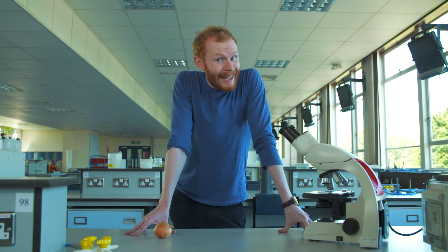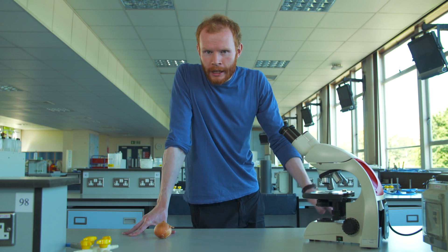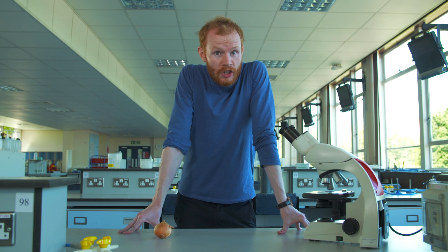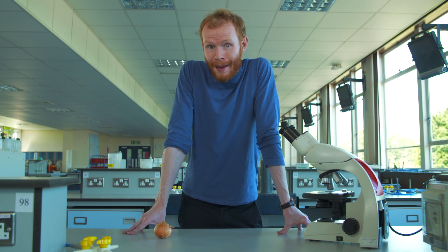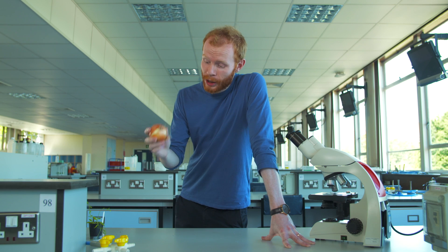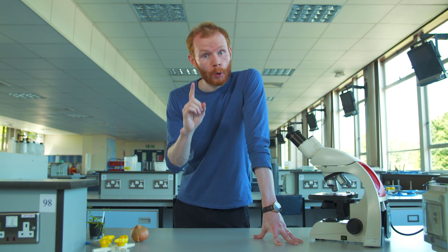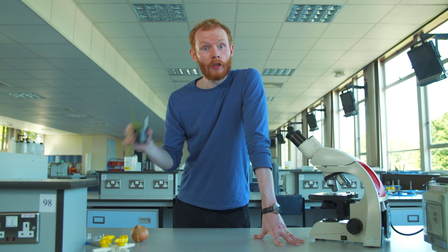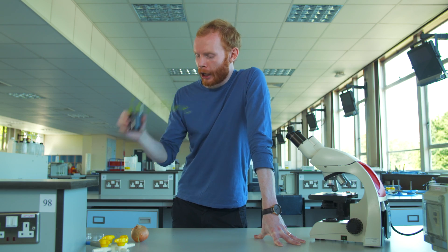One experiment we may all be familiar with is using a microscope like this to identify the stages of mitosis — the cell division involved in growth and repair — in something like an onion root. Here at Birmingham we're using an almost identical process to examine another form of cell division called meiosis in the model organism Arabidopsis thaliana.